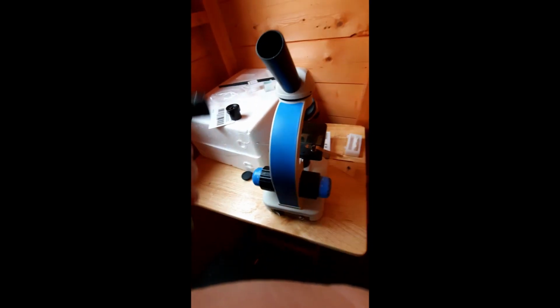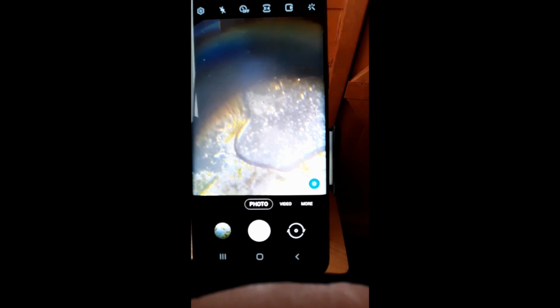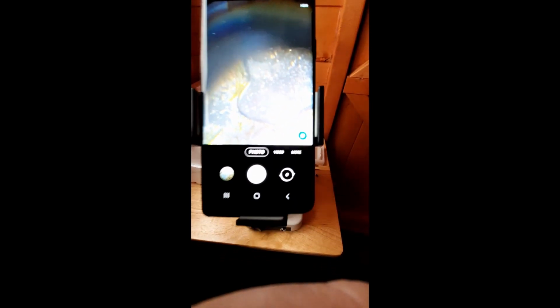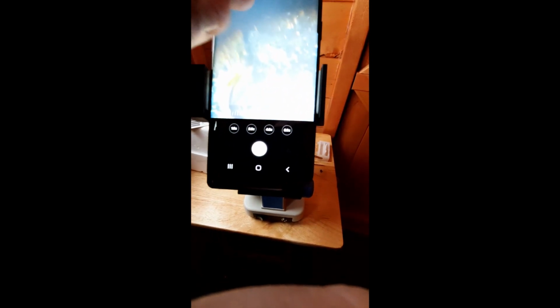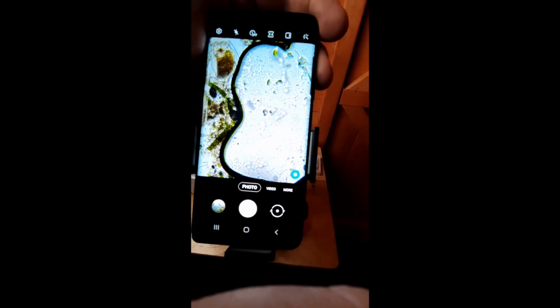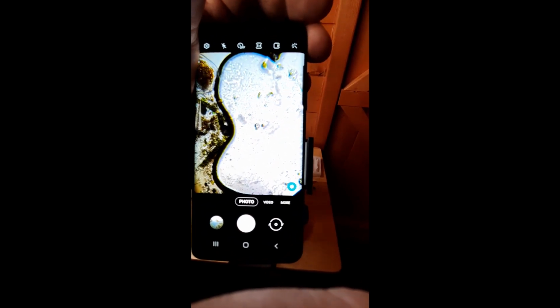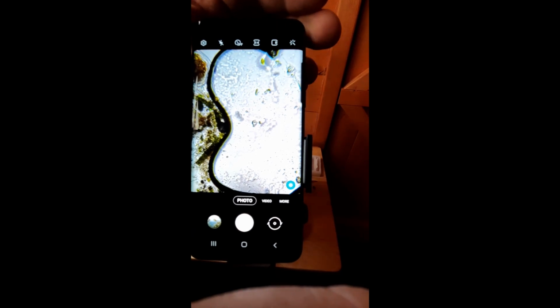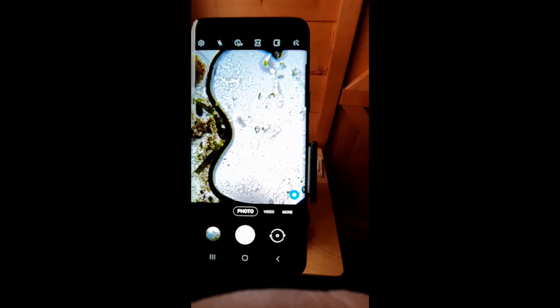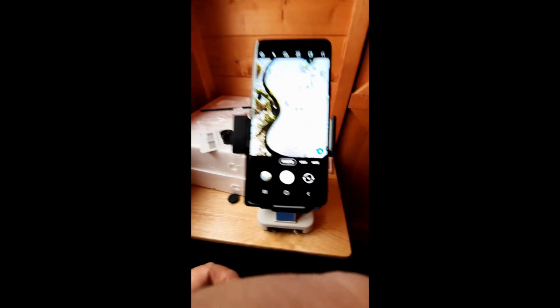pick it up. Doing it one-handed here. And just slide it into your microscope. And there we go. And then all you do is just slightly align it by just turning it. Like that, just gently to align the lens up. And there you have it all working.